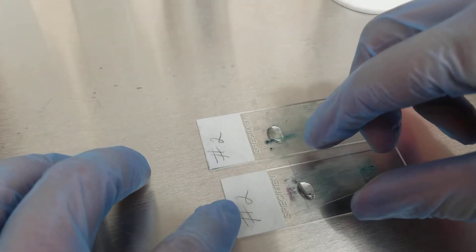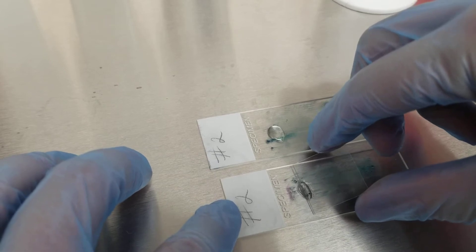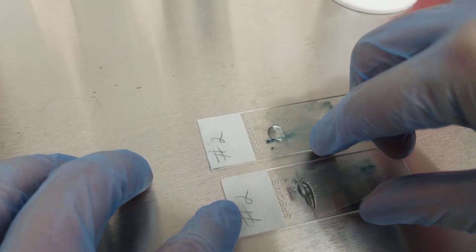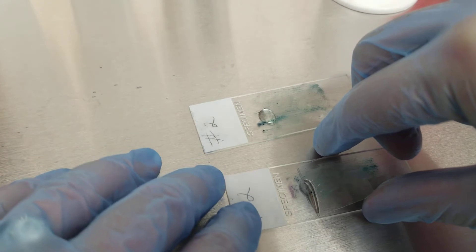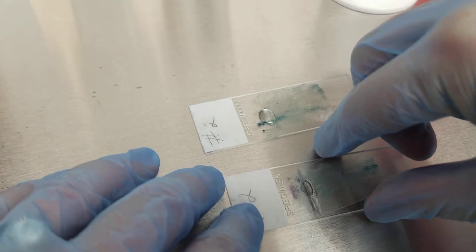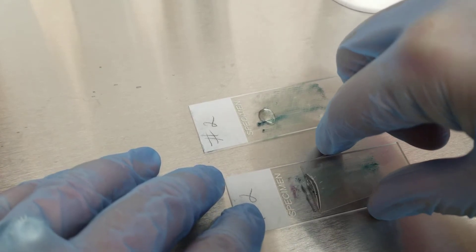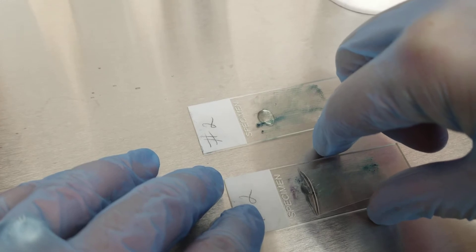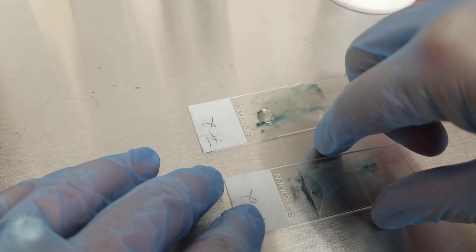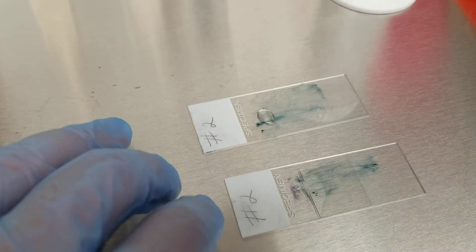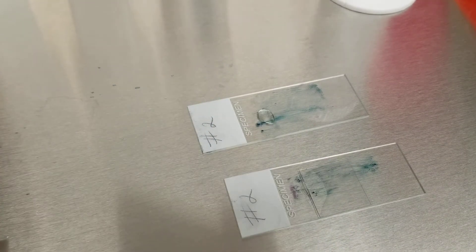But what you're going to do is the same thing you do with the wet mount where you let it go all the way across the slide to get it wet, kind of like a blood smear. And then you're going to let it fall on there and it should spread throughout the slide.